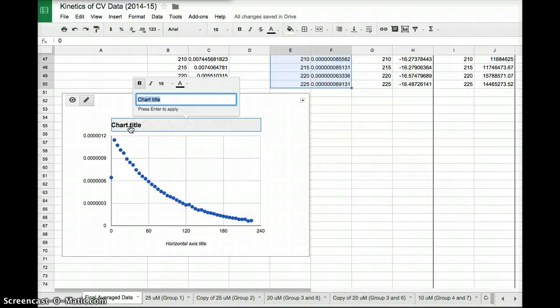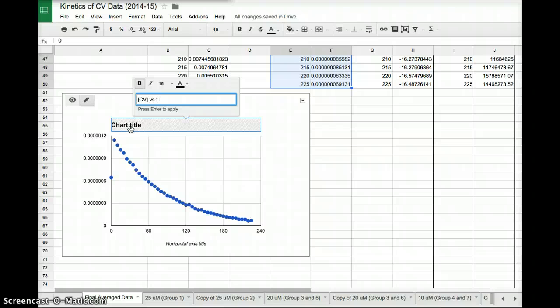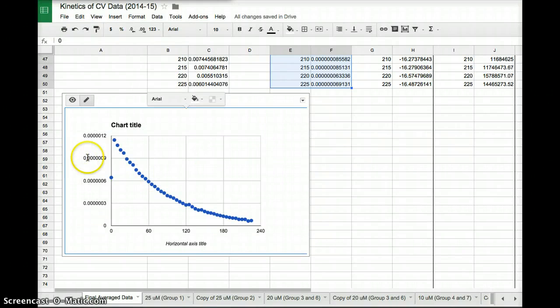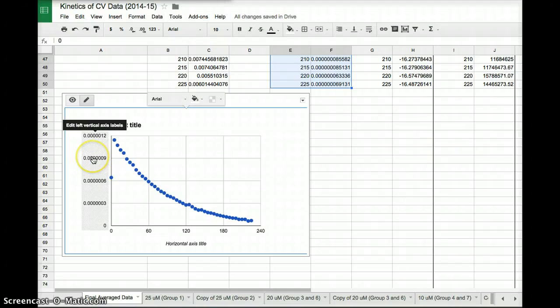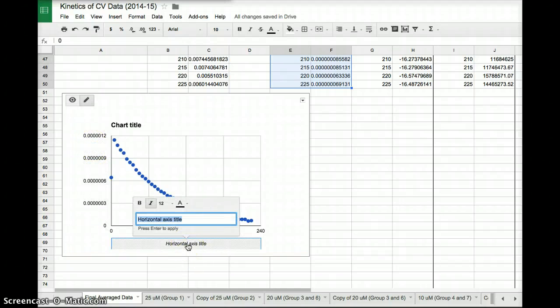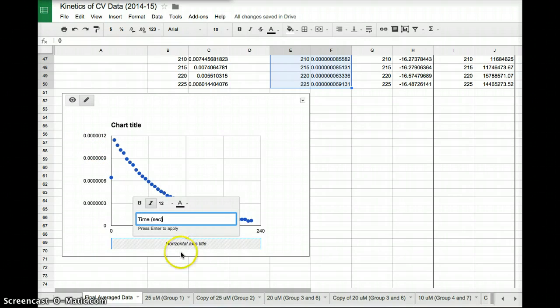And I want to name it with my Y versus X. So whatever's on the Y axis, I'm going to type that first. So in this case, it's concentration of crystal violet versus time. I'm going to also remind myself that this is zeroth order. That's how I'm going to label this. Okay.